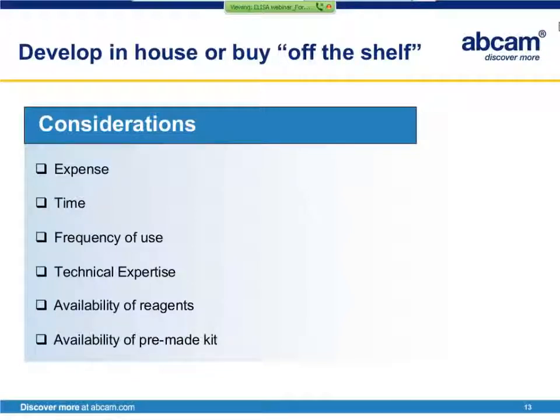Similarly, the option to purchase a pre-made kit will depend on the existence of this kit. If the specific ELISA you are interested in is not yet available as a pre-made kit, then you are limited to developing one in-house.